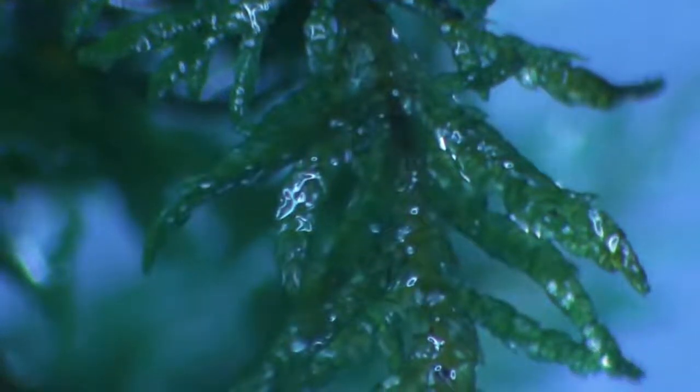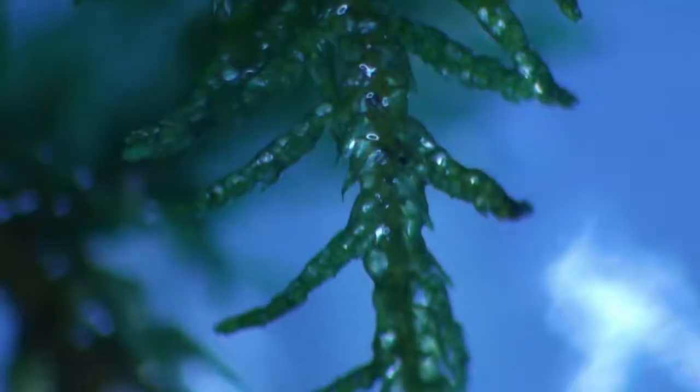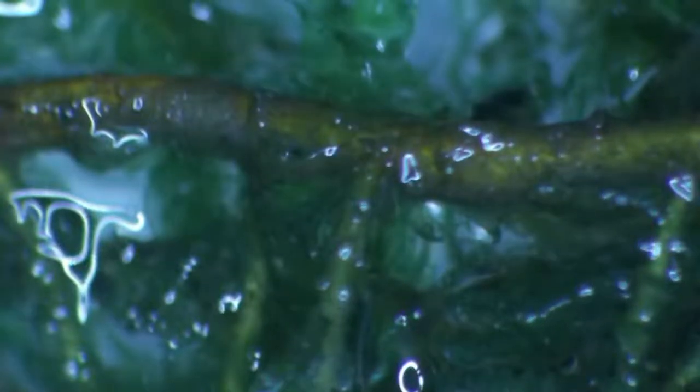Kind of see the scale-like leaves on the moss. It would look better if it were dry. The water's kind of messing up the view a little bit. Those are so shiny. But I was hoping I could find some little critters on here. Do is kind of shake this loose a little bit, and through the collected water here, you can sometimes see some microorganisms even at this scale.